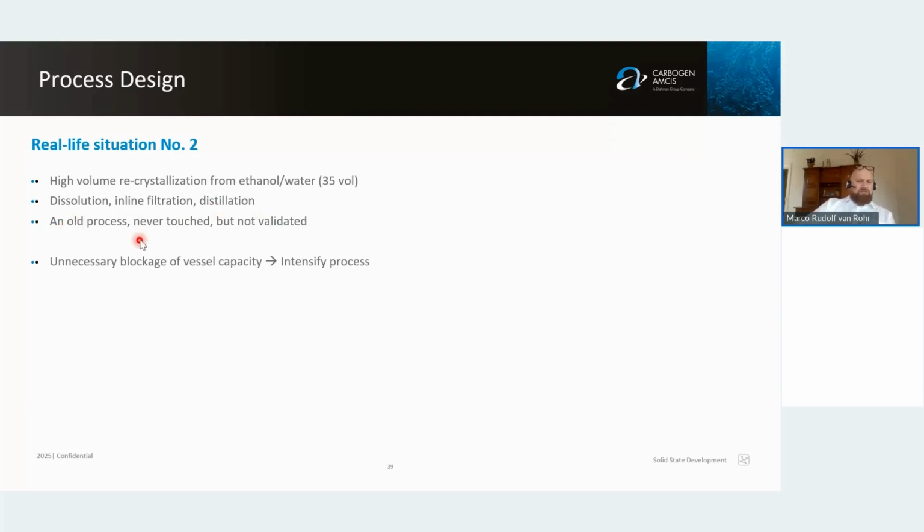It's an old process. It was never touched, but it was not validated because it's not in a GMP sequence, but it poses an unnecessary blockage of vessel capacity. So we were asked to intensify this process.